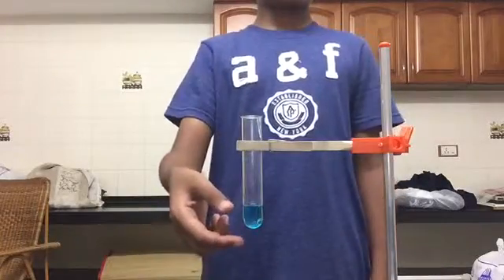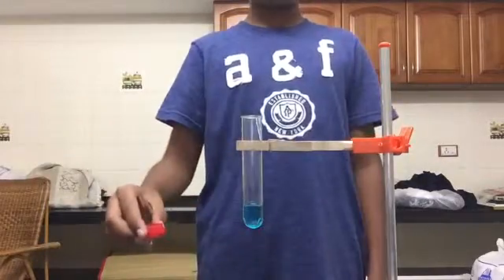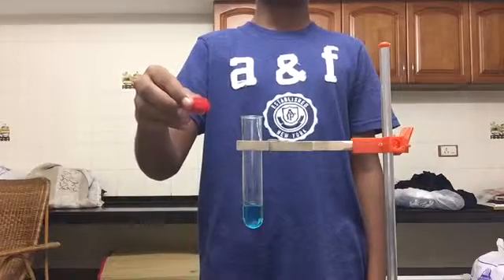For this we're going to need a fair amount of copper sulfate solution. I have some iron filings here with me. I'm going to be dropping these iron filings into the copper sulfate and we're going to be observing what happens to the solution after a while.